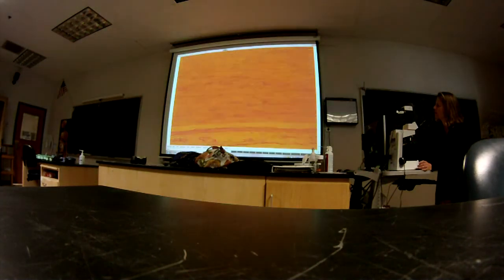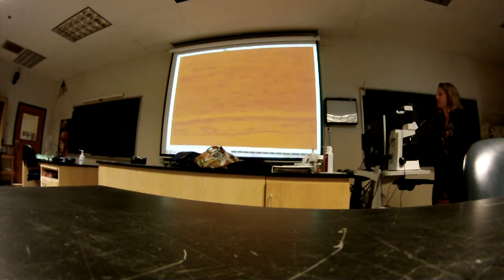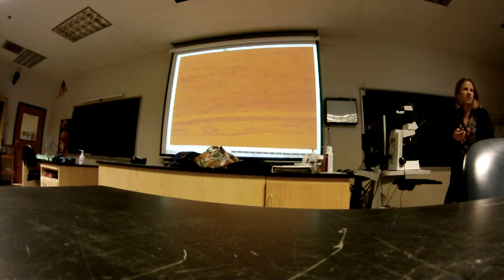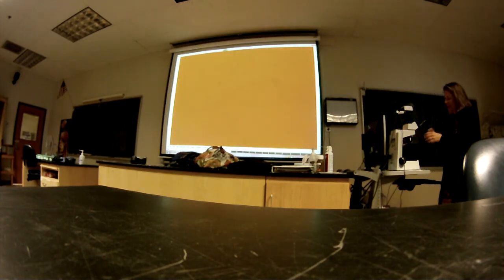So I don't really find this one super useful. This one is just a longitudinal section, but I don't think it's very useful to us because we can't differentiate anything from anything else. You can't differentiate a myelin sheath from an axon, but it's myelinated axons. You can see the nuclei; those are from the Schwann cells. But I don't like it because it does look like smooth muscle as well. That was the longitudinal section of the medullated nerve, which is not very good. So we won't use that one.